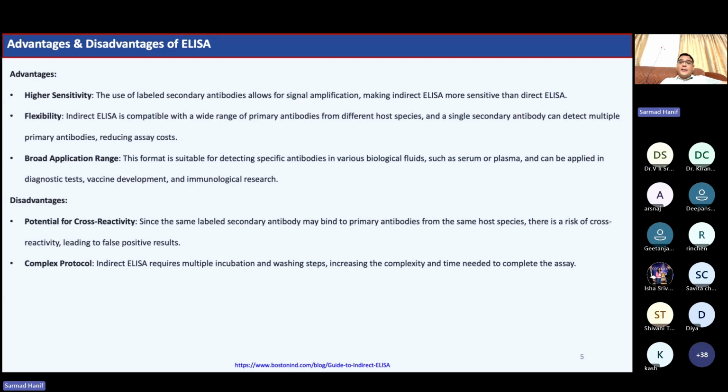I'm not saying that you are detecting two immune responses, or the immune responses of two different infectious diseases at one time. No, what I am saying is that if you are doing the ELISA for Haemophilus influenzae type B, and you are using a secondary antibody labeled as A, for mice, which is raised in goat, but is very specific to the mouse antibodies.